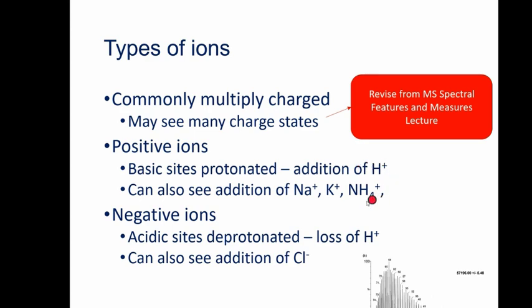Commonly, you want to get rid of these other adducts. So if the molecule has a sodium adduct, then we call it a sodiated ion, or potassium, a potassiated ion, or an ammoniated ion, in the same way that we call the normal one a protonated ion. So if you've got lots of sodiated or potassiated ions in your result, it does potentially make the result more complex, because if you had an already complex sample and now you've got 4 different sorts of ions there rather than just one, it is going to make the spectrum much more complicated. So under those circumstances, you may choose to use some sort of ion exchange method to get rid of the metal cations and predominantly show the protonated molecule in that spectrum.